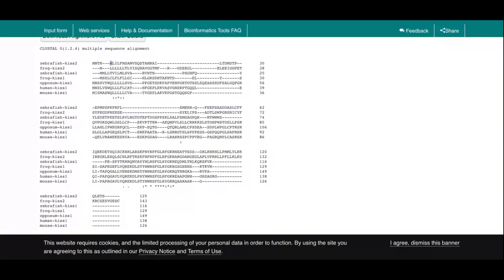Okay, so this is how we read the rows: what are the sequences for each of the entities we are comparing? And then here on the bottom, there are some cues, and I wanted you to figure out what those things mean. In some places those cues are absent, like nothing here, nothing over here.